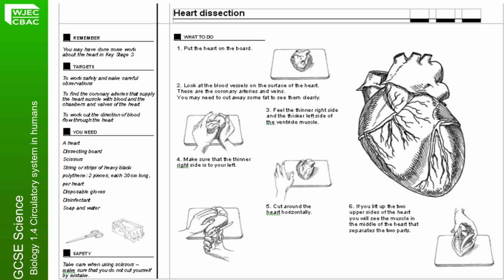Disinfectant is for cleaning the board down afterwards, but equally a surface spray at home, an anti-bac spray, a cleaner that you use for cleaning your kitchen will work just as well. Just make sure you give that board a good old scrub and some hot soapy water, to clean it afterwards before using it for any further food preparation. And if you have separate boards for chopping vegetables and meat on, use the board that you would chop meat on, and soap and water is for your hands.